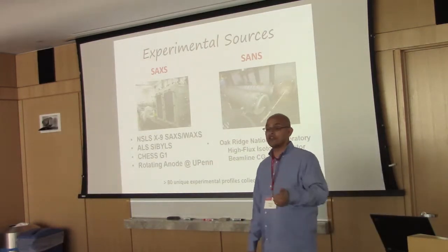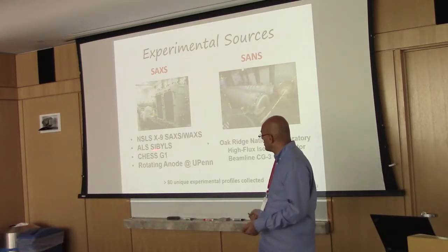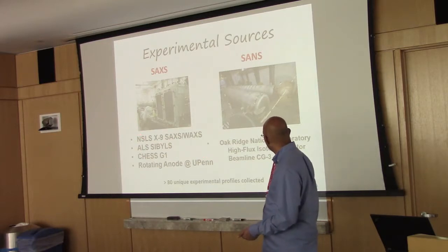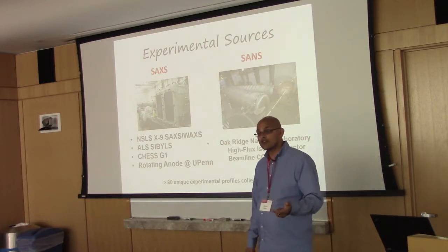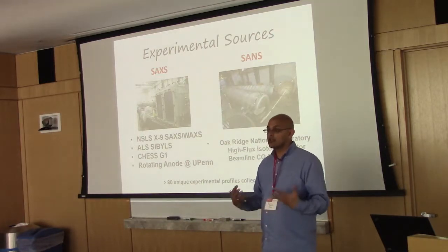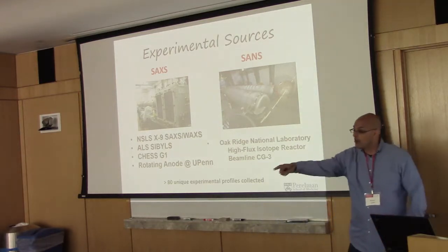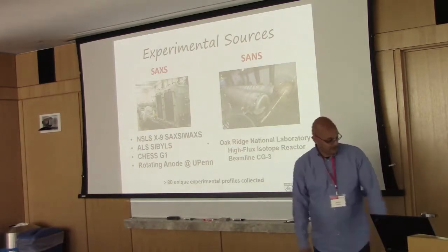We've characterized 6 different variant nucleosomes, and we've made extensive use of synchrotron X-rays, home source X-rays, and 2 different neutron sources, actually this is missing NIST here too, bringing all this information together to try to gain these insights. So this is something that's been a long time coming. Going back to your question, how many trips? Too many. I don't even want to talk about it.